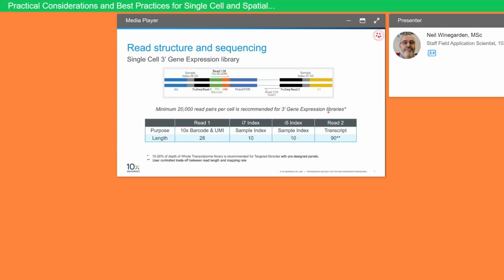The resultant sequencing-ready library from a single-cell transcriptomics experiment contains the barcode sequence, UMI, and a cDNA insert sequence that allow for mapping of individual transcripts onto a reference transcriptome and the association of that transcript with the cell of origin.